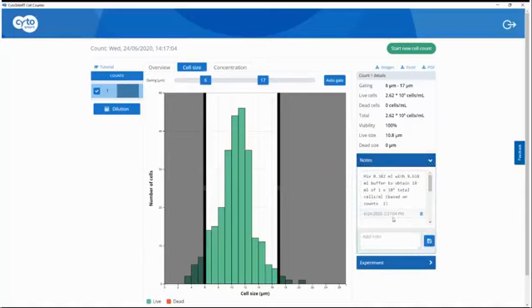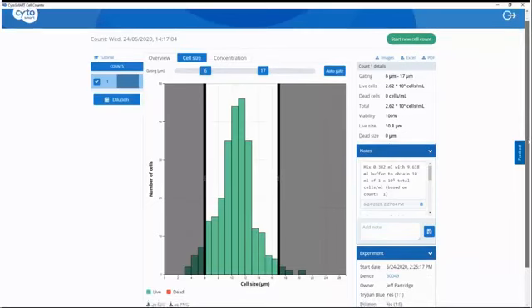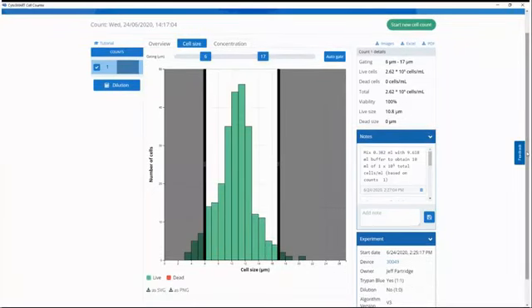So you can see this note right here. I can also put another note, for example, say, these are MDA MB231s, and then I can save that. And that's saved, and then you can look at that later in your experiment. This says who did it, when it was done, did you use trypan blue? The algorithm is optimized for trypan blue. You do not need to use it. It is recommended because the algorithm is so optimized, but it will count just as fine without. So again, that's for a count.